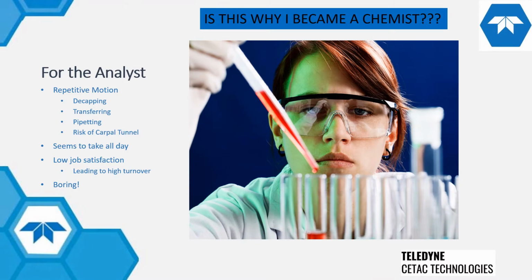Well, for the analyst who's actually doing all the pipetting, decapping, transferring, and so forth, they can spend a large portion of their day doing repetitive motion. And sometimes it feels like all they do in a given shift is move one rack of tubes from one place to another, maybe type a little bit on the computer, and then go back to pipetting. This type of work can lead to low job satisfaction because it's at its core kind of boring. I mean, you're doing the same thing.